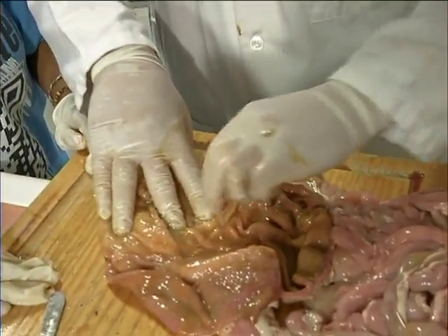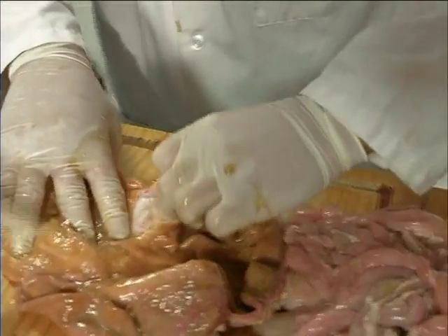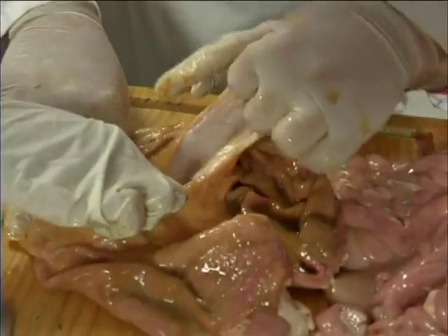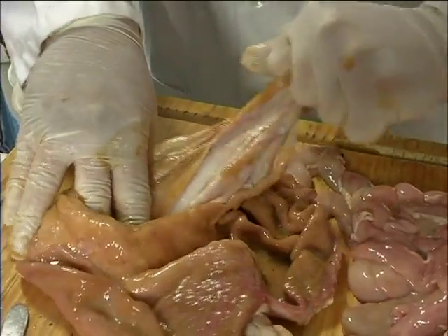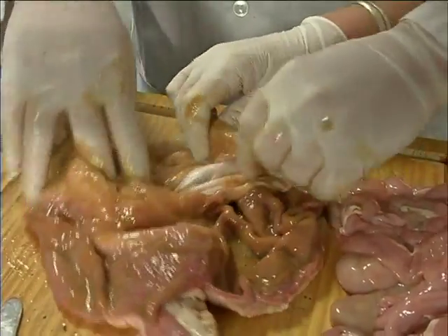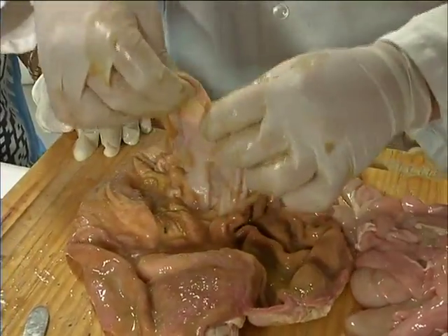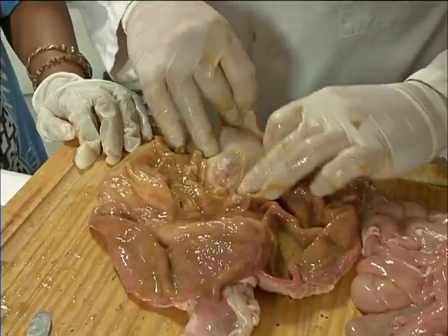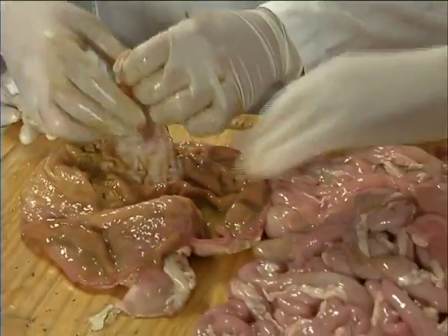And look at this. There is the stomach lining. I'm trying to pull. Now, normally you do not pull, but I like showing you things. This is what people call tripe in sheep. And yes, this is the tripe. Now, this is the stomach lining. Look at the difference. Right? You see how nice and white that is? And then look at how creamy and yucky and ugly this is.